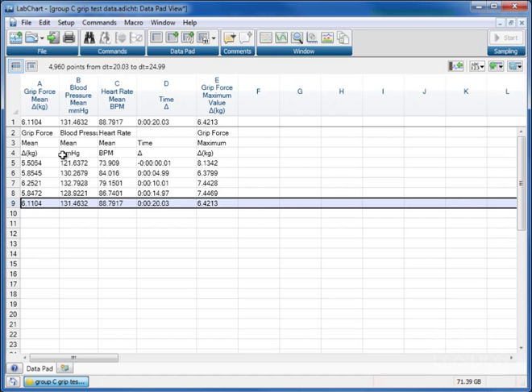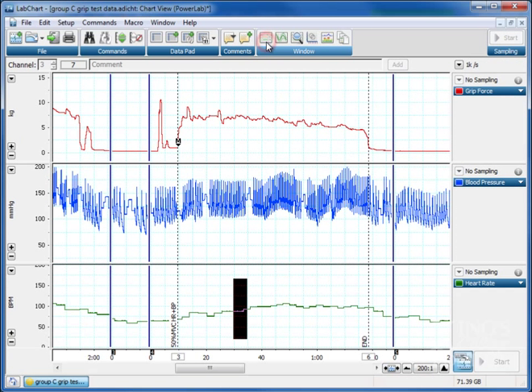So we don't want to use that, but you could easily set up some calculations, which we'll come to in another tutorial. So I hope that's helped in giving you some basic use of the data pad to bin your data and copy it into Excel. Thank you.